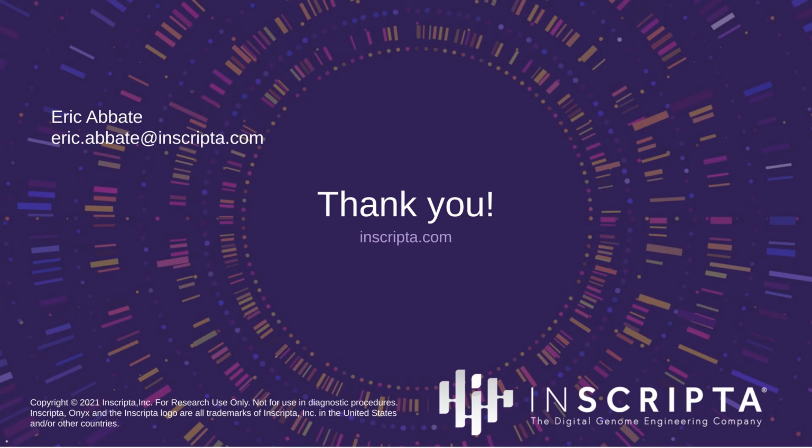Thank you. Next question. Can you further describe the use of barcodes? Are they incorporated into the genome? Yeah, good question. They're not incorporated into the genome. They're actually maintained on the plasmid. There's a plasmid that is used for editing in yeast.